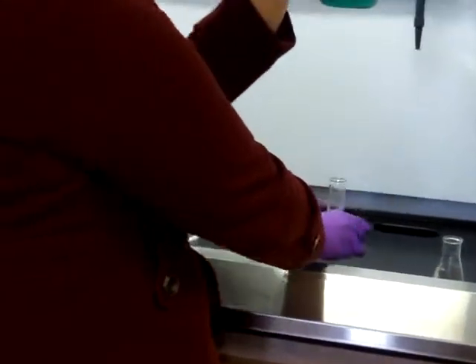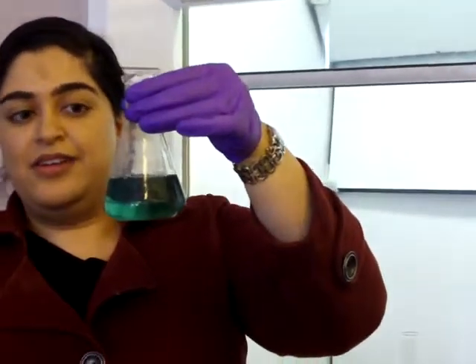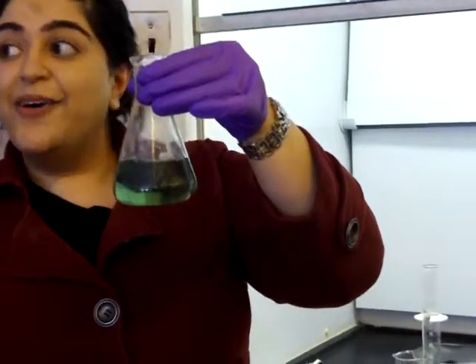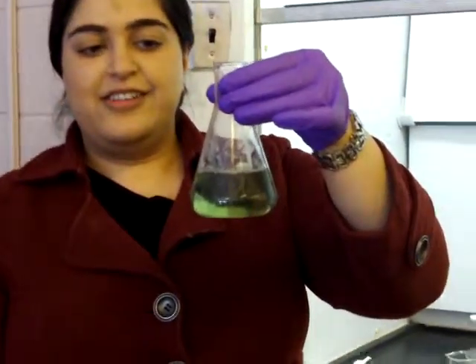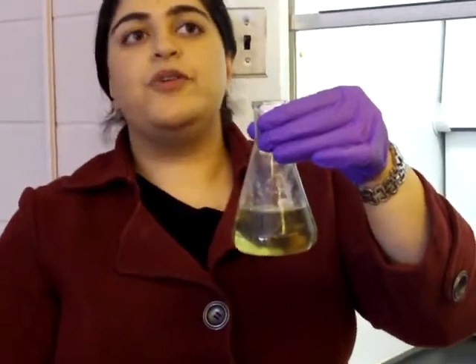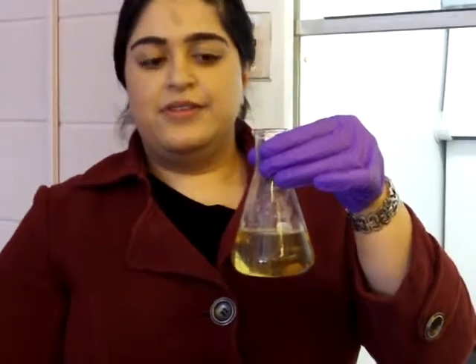Okay, so it's going to change color multiple times. It went from purple. It's now green. It's going to change to yellow. Oh, there it goes. Yeah. And then if you let it sit, eventually it'll turn back to clear. Cool. Yeah.